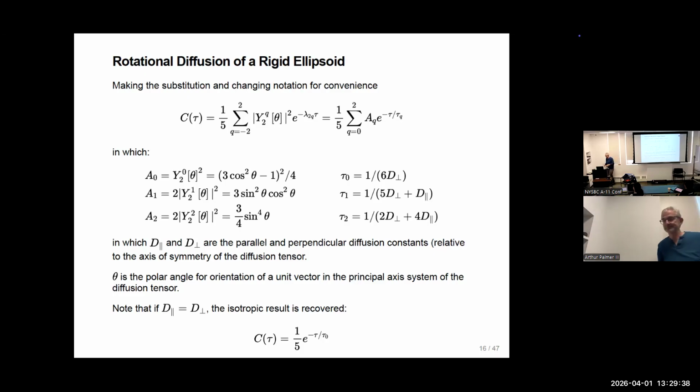So it turns out to be a very powerful way to measure diffusion tensors, rotational diffusion tensors. If you do this by fluorescence, the other main way of doing it, you have very few probes. Here we tend to have lots of probes pointing in various directions. The one time this doesn't work very well, of course, is if you imagine that you have, say, a 4 helical bundle, then all the NHs basically point along the helical axis. And it becomes much more difficult to get this to work well. You don't sample the orthogonal directions very well.